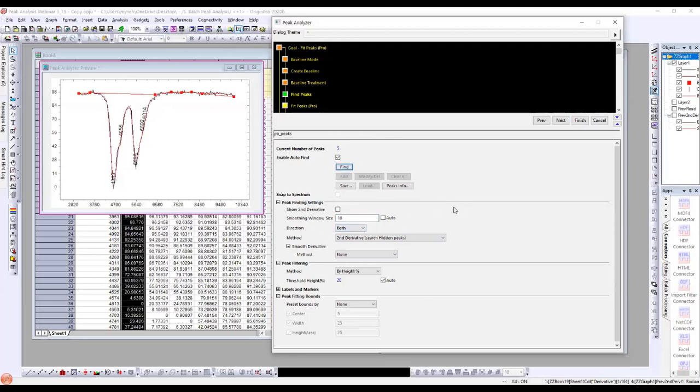The thing here is it might find many other unwanted peaks, so I will put in some peak filtering method. For example, by number, I only want to find 3 peaks. Now only the 2 obvious peaks and 1 hidden peak are found for this example.